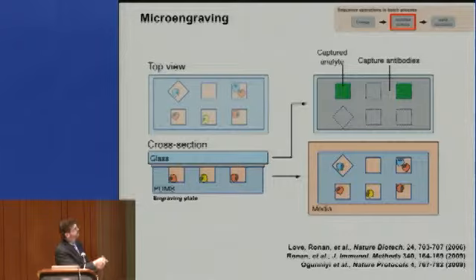It's non-destructive. On the one hand, what we get is a protein microarray, where each element in the array now matches spatially to the array of sub-nanoliter wells. And on the other hand, we retain the cells. They sit in the individual wells, and we can put this back into media to analyze further or to recover cells that might be of particular interest.